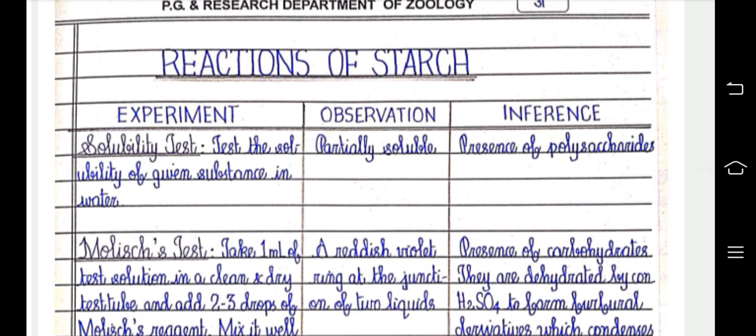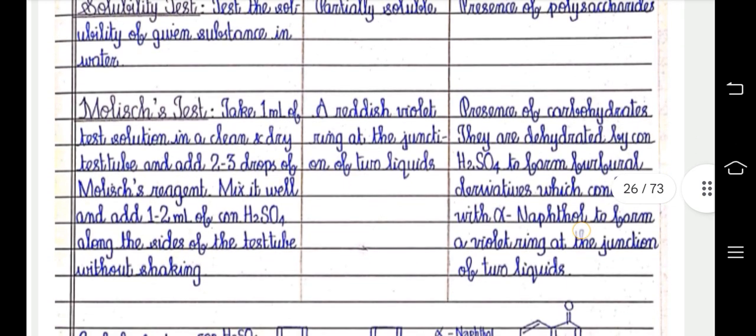Reactions of starch experiment. Solubility test. Test the solubility of a given substance in water. Partially soluble. Presence of polysaccharide, not completely soluble.